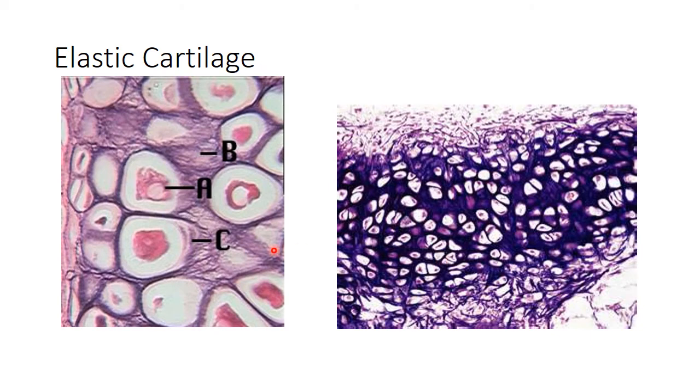So as you look at this, what do you got in there? You have a cartilaginous cell. What's a cartilaginous cell called? Come on. Chondrocyte. There you go. What's the little chamber it's held in? What's that called? The lacuna. There you go. All right.